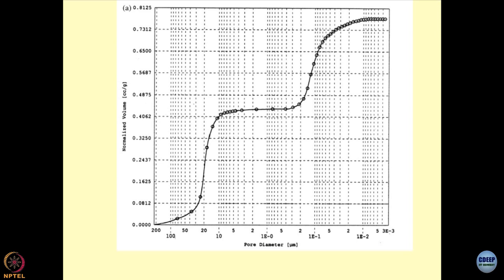Now, 2-3 ways are there to negotiate this type of situation. First of all, I will never expose the sample to very high pressures, fully knowing the fact that the capillaries or the pores might collapse. But if you reanalyze this graph, you will realize that the constant volume indicates, what could be the reason? This could be the inertia of the fluid also, the mercury also, clear? Because the pore diameter is still changing from 10 to 2.